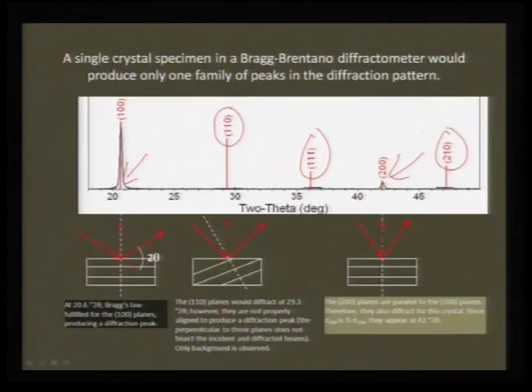So, just by looking at it, you can easily trace that when several peaks are missing and only a few peaks are represented in your X-ray scan, you can say those belong to a particular class of HKL reflections. Okay. So, you call this 100. When you put it within these inverted brackets, then you say that this belongs to the H00 type of planes. So, you will get only 100, 200, 300. This also talks about the orientation or the texture of your growth.